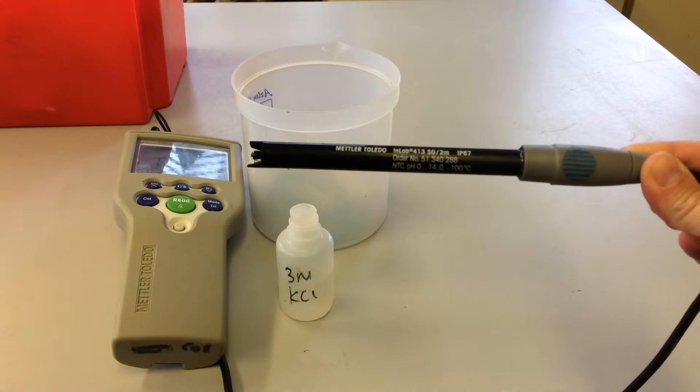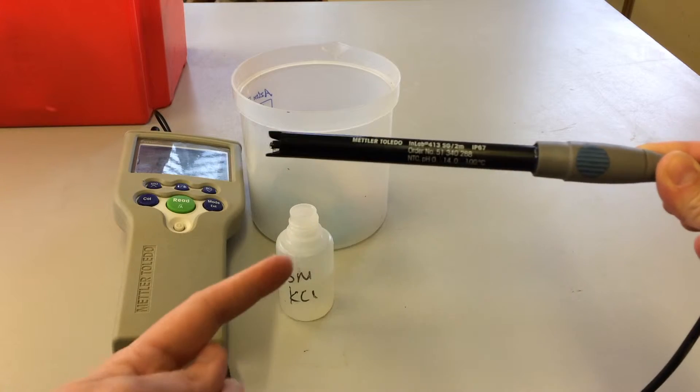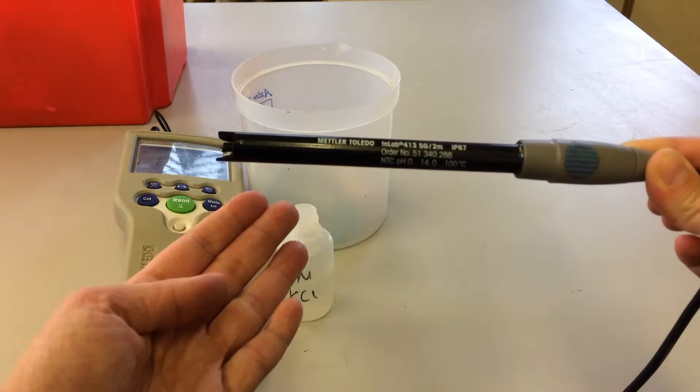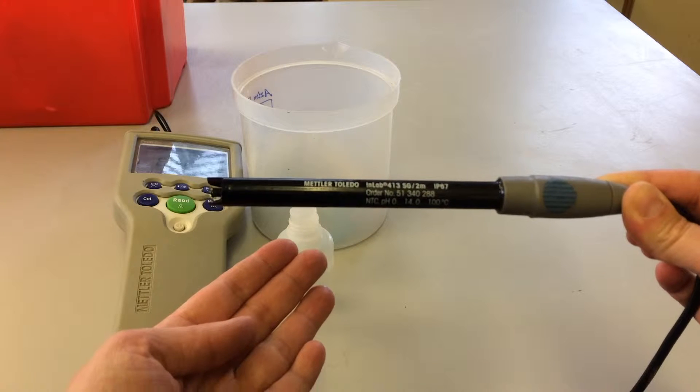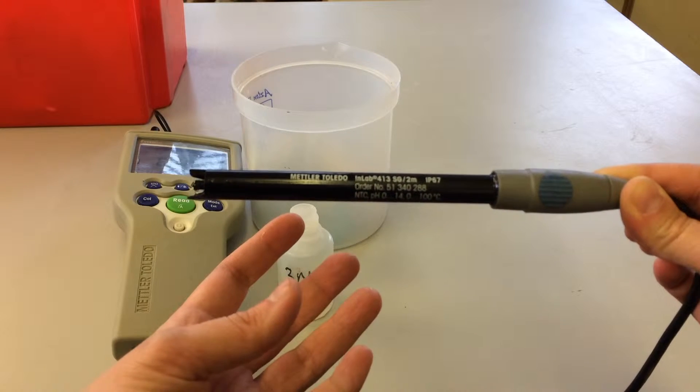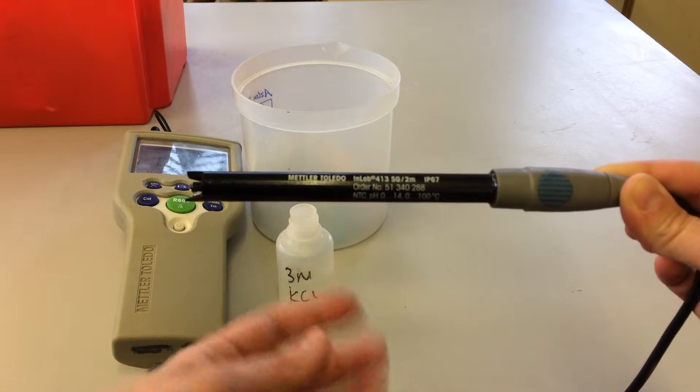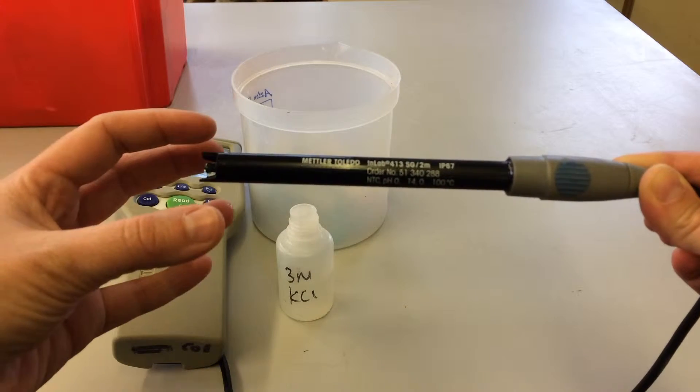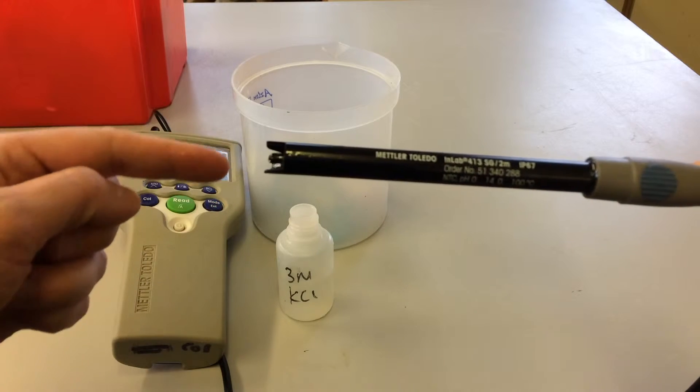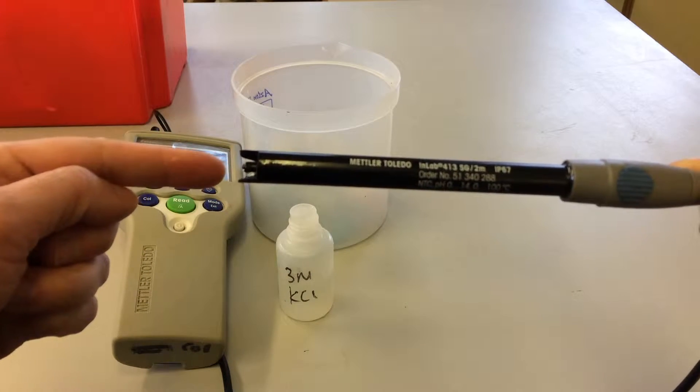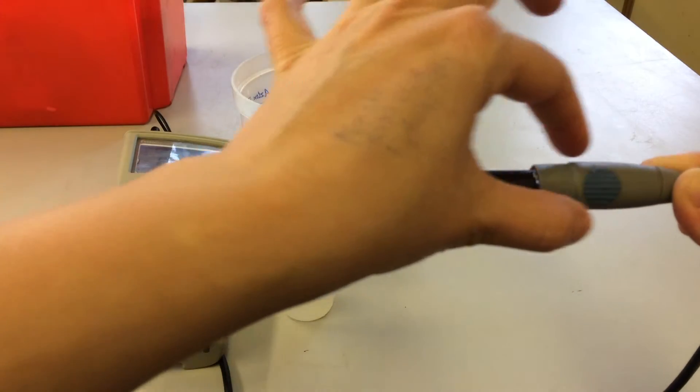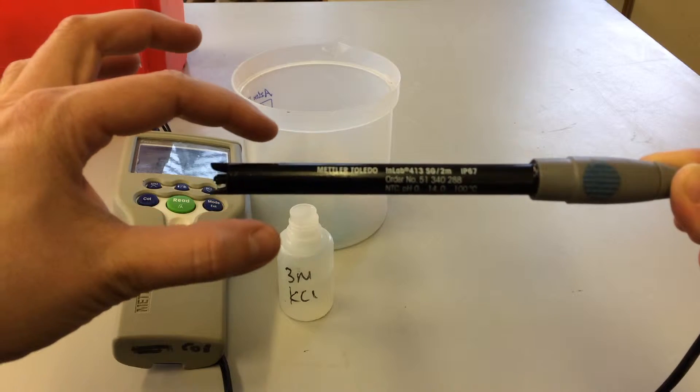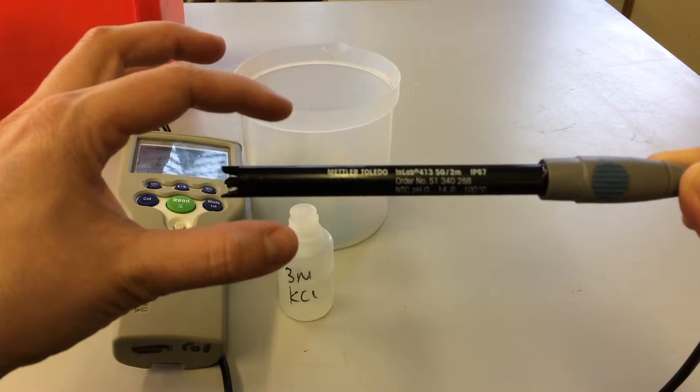Just to talk about the probe here, so this probe is a very expensive probe if you're a student, so bear in mind to handle this with care. One of these costs about 200 pounds. Now it's expensive because it has a thermometer integrated in here with a pH sensor and also this section here is made of glass quite often, and the wires in here can be quite sensitive to knocks and bangs.